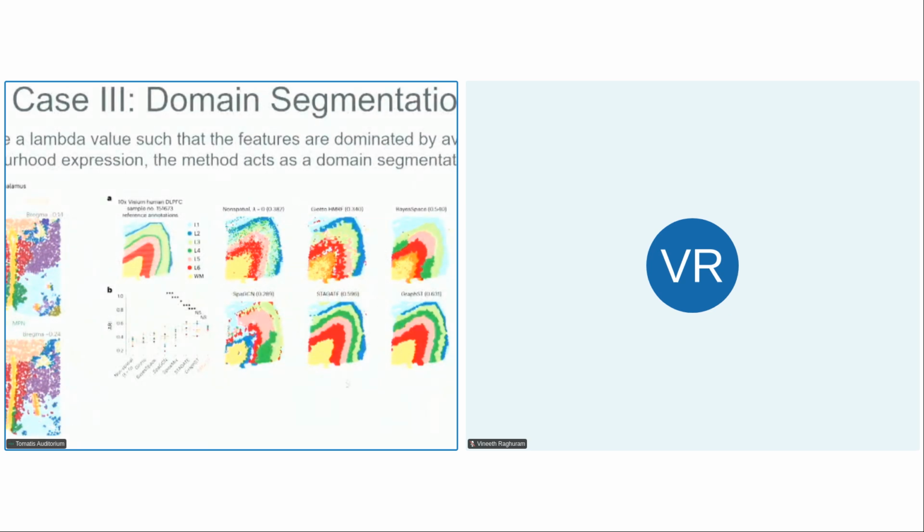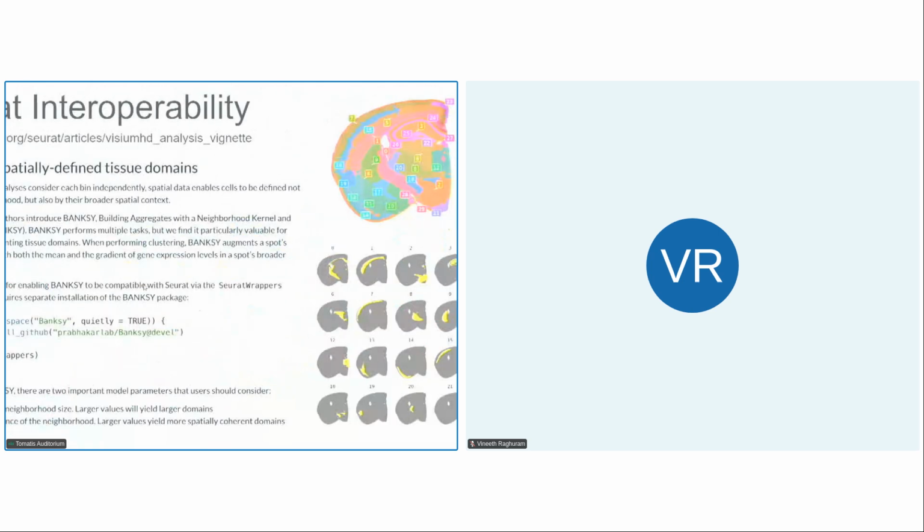It's all within the same framework. And it was nice to see that this is on the Seurat website. They have a spatial framework now, and they suggested using Banksy for Visium HD data analysis. So we have a Seurat wrappers version of Banksy that you can use with Seurat objects. Although today, Joseph will just show you the Bioconductor SingleCellExperiment spatial experiment framework. But you can use it with Seurat, or if you prefer Python, it's also in the ScanPy framework.